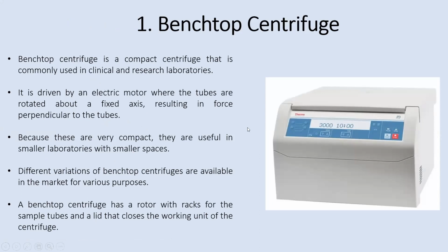This is the benchtop centrifuge, which is very handy, very convenient to use. It is kept on the bench, on the working table, so it doesn't require any floor space. That is another advantage, because in the labs there is a limitation to the space that you have in a working lab, and you have so many other equipments to keep.